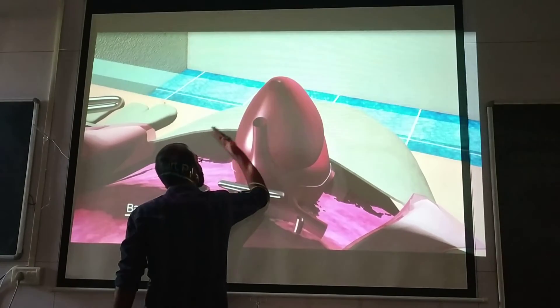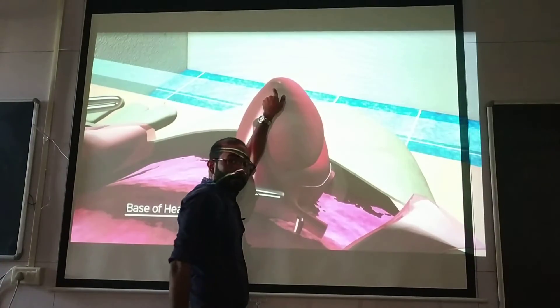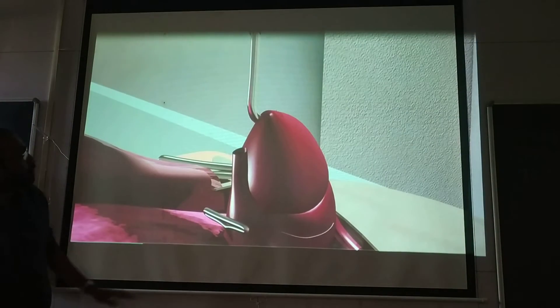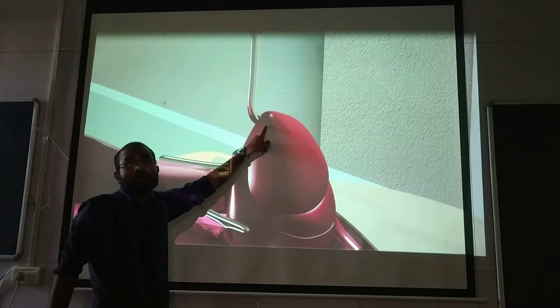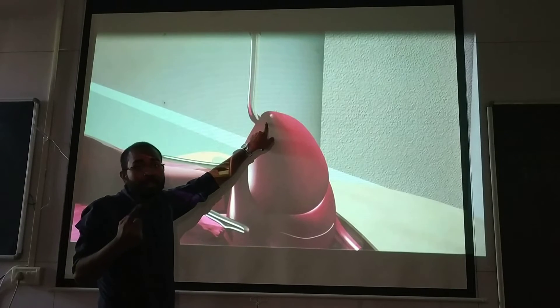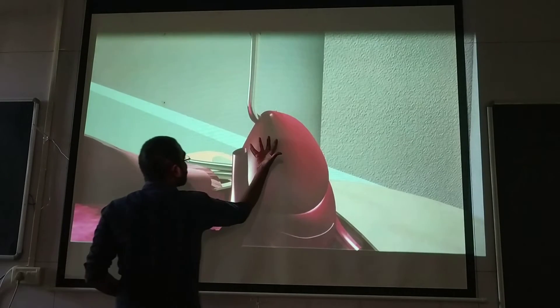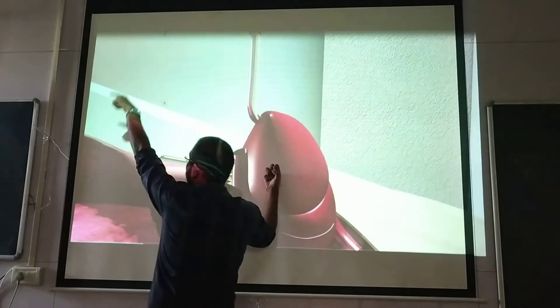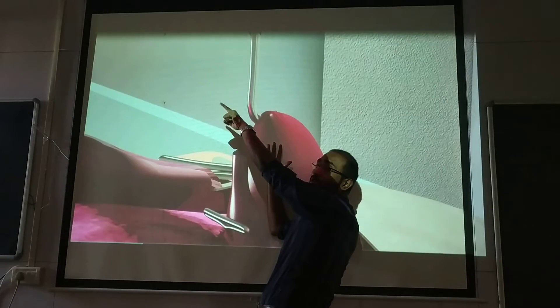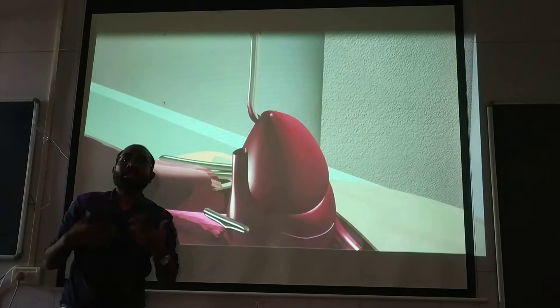The ventricle is lifted upward. Now we insert the hook here into the ventricle. Make sure there is no puncture — if puncture happens, the heart will be damaged and all its properties will be lost. Once the hook is inserted, as the heart contracts, the lever will come down. When relaxation occurs — diastole — the lever will go up. That is the recording mechanism.